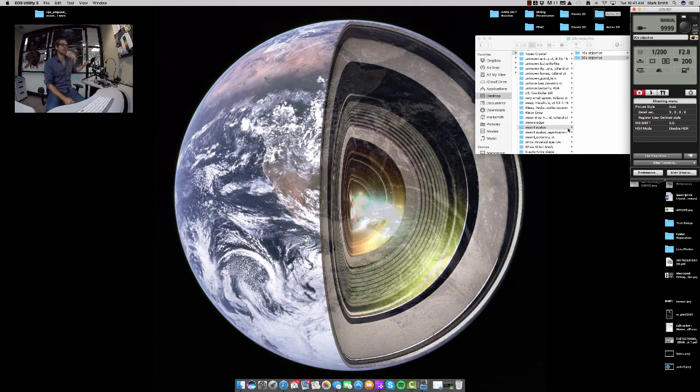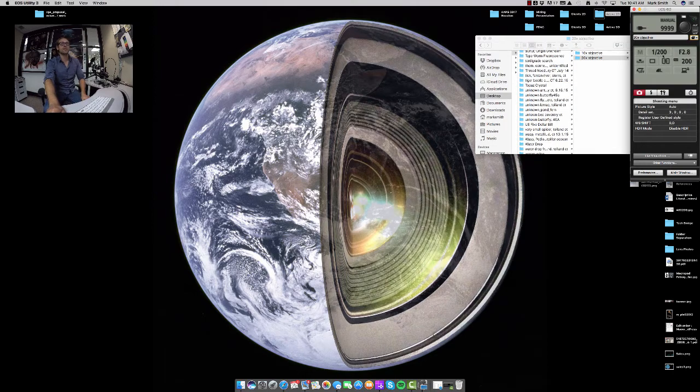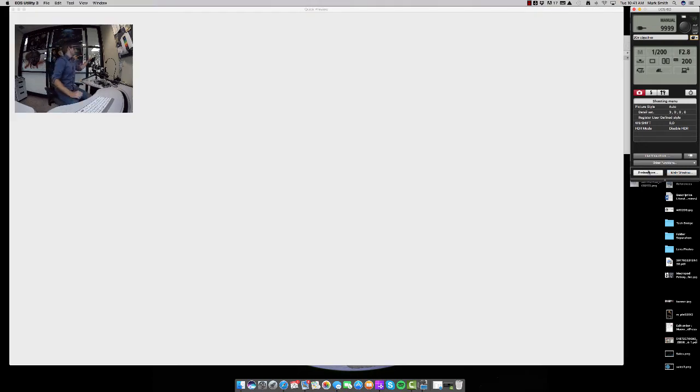Now we have our flash on. We are going to up the power of the flash a bit from where we were at the 10x, but the exposure will stay the same at 1/200. The aperture never changes when using this lens — it's always at f2.8, that way you eliminate any vignetting around the corners. And the ISO, we had it at 200 and we're going to see if we can keep it there. From 1/32 we're just going to power it to 1/8 and capture a test shot, so we're going to be about three times as bright as we were when using the 10x objective.